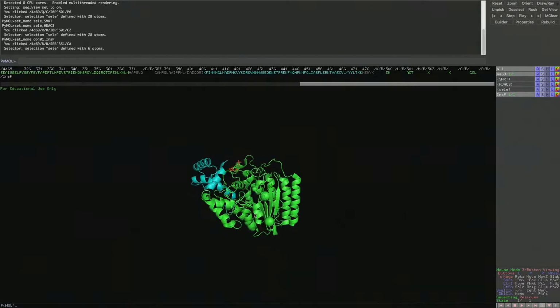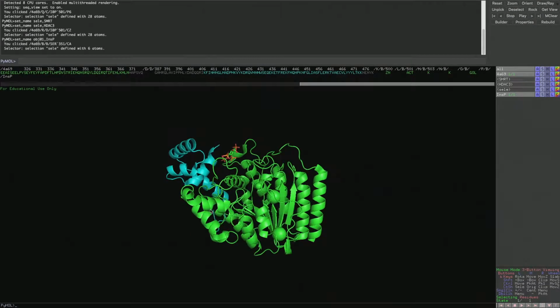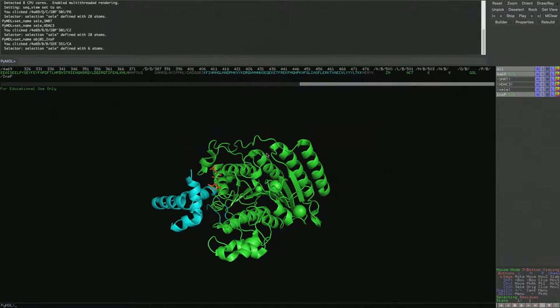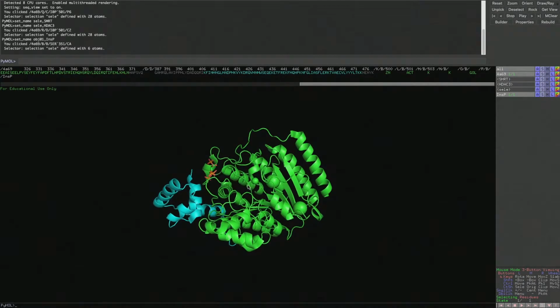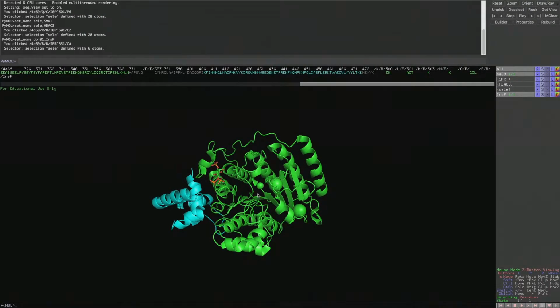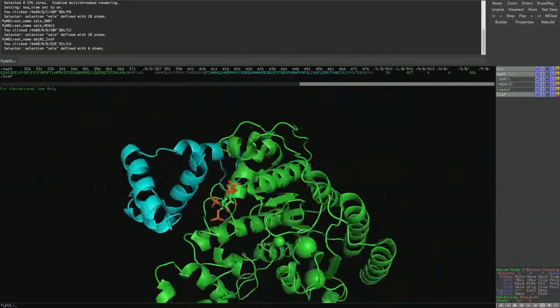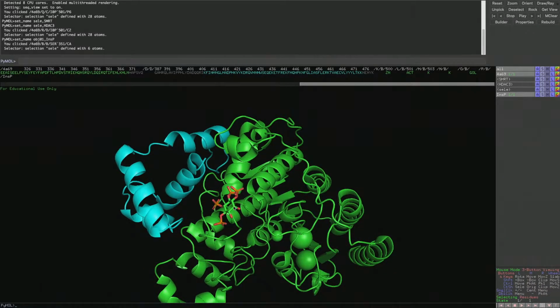In this video, I'm going to investigate how this molecule here binds to this protein. To do that, we're going to look at hydrogen bonds. Does it make any hydrogen bonds? We're going to look at the surface interaction, charge interaction, sorry. We're going to look at what happens if I was to mutate residues in this binding pocket, and measure the lengths between two atoms. So to start, is this a hydrophobic interaction or is this a hydrophilic interaction?